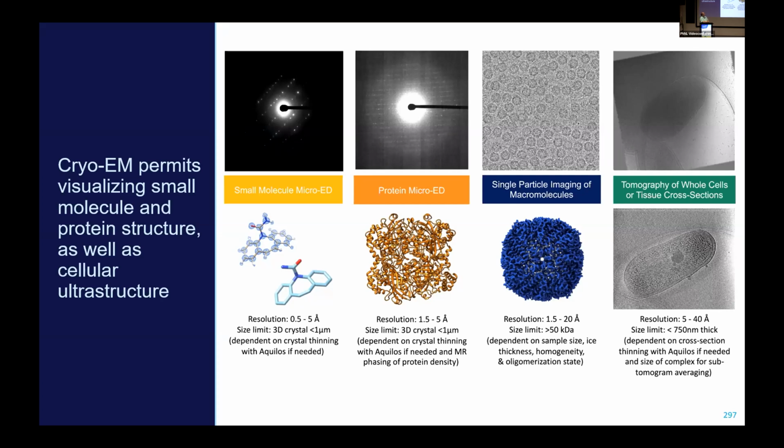In addition, if we have a protein that forms a larger macromolecular complex, or you're interested in understanding the details of its localization or its interactions inside of the natural cell environment, we have the ability to do whole cell electron tomography on it and see every single density inside the cell unambiguously, and be able to identify the overall interactions that are occurring. And ultimately, if we have a high enough copy number, you could do subtomogram averaging and still get near atomic resolution of your protein of interest.